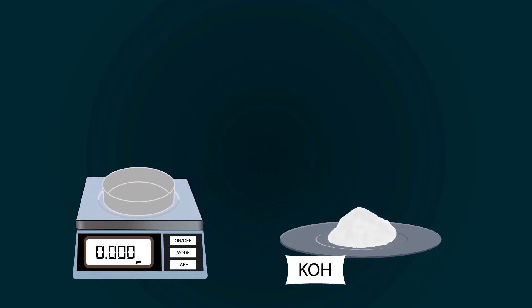Now start adding potassium hydroxide into the petri dish with the help of a spatula. Weigh precisely up to 10 grams.